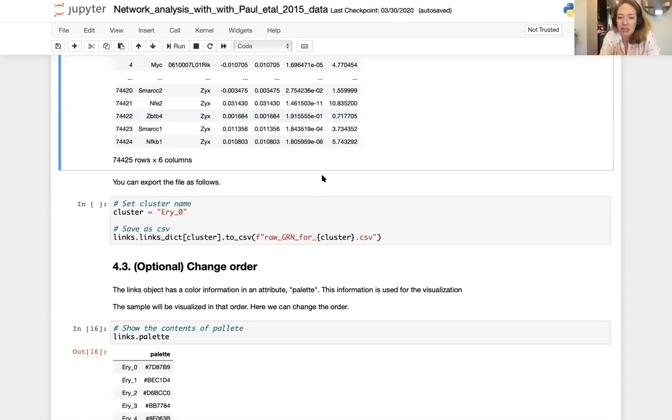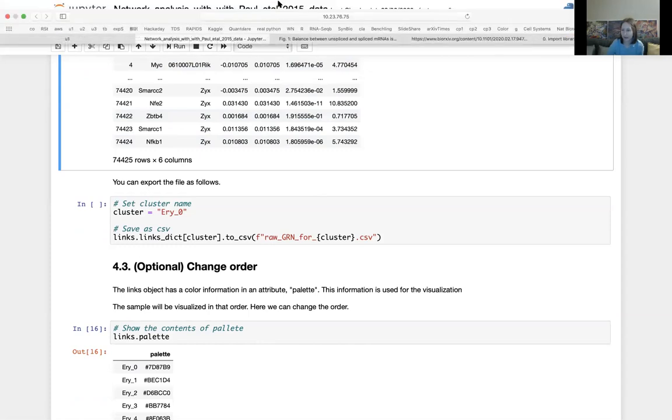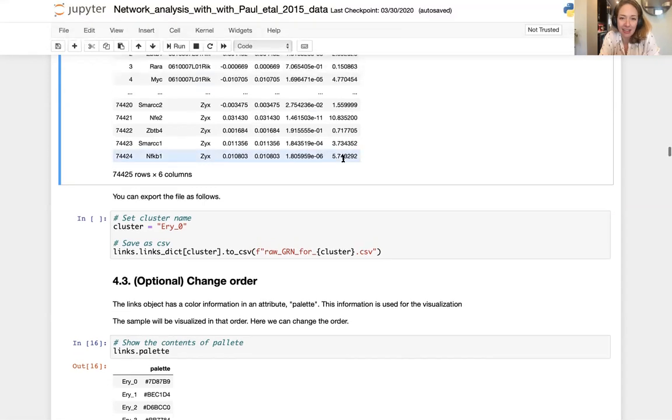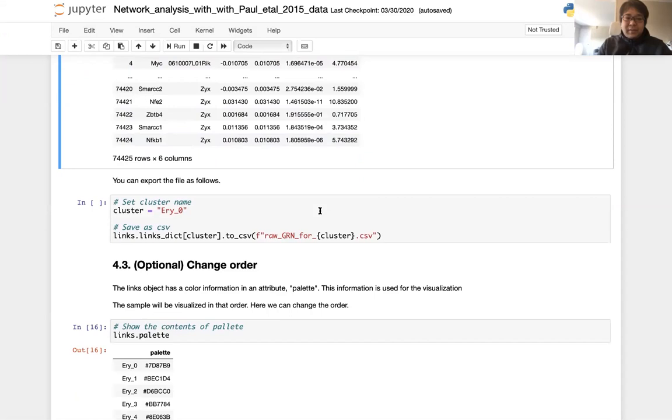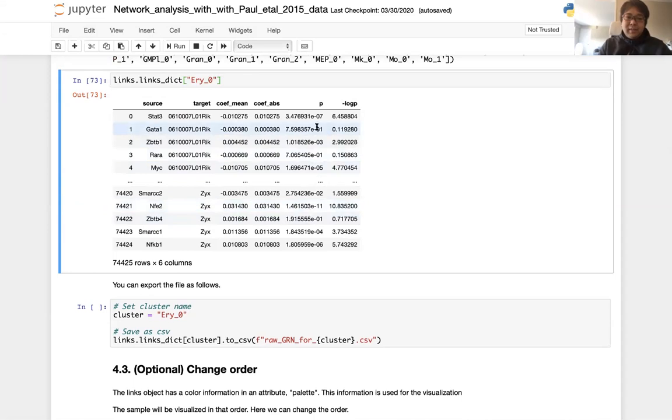I remember, Christy, you were looking at the distribution of the p-values as well. Did that throw up anything interesting or obvious? No, I was trying to make sure that the distribution wasn't terribly skewed, and when it came back looking okay, I moved on. Okay, got it. So maybe it's challenging to decide how to set the threshold.